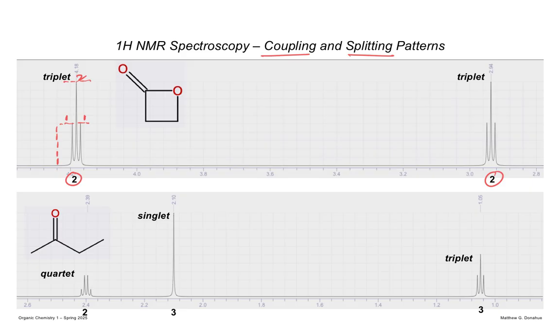And then the other thing is, there's an odd number of lines, right? There's 3 lines in a triplet. You have a distance between the lines. So there's these 2 distances. It's kind of tiny, but this little baby distance there and there.